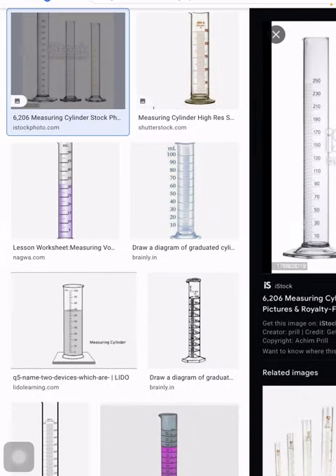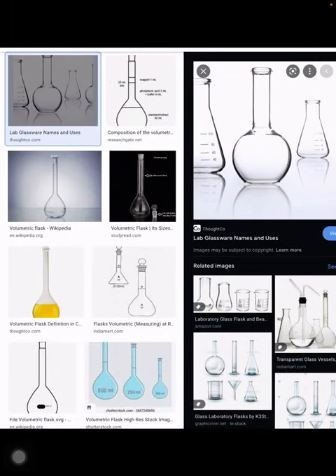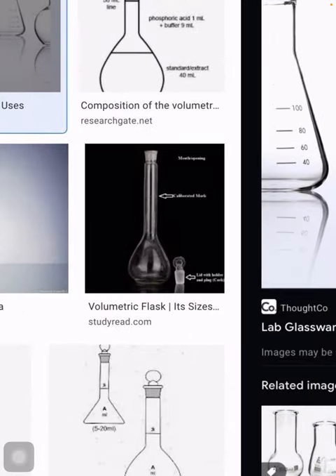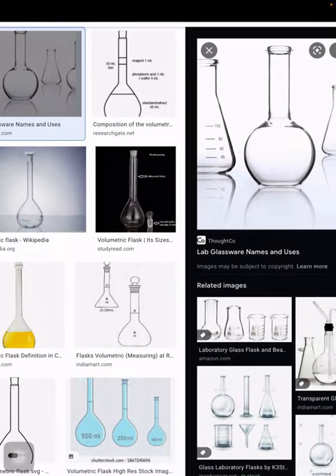Now moving to the next side — this is the volumetric flask or measuring flask. It is a flask with a long narrow neck and has one calibration mark at the top. I'm zooming in and you can see the arrow at the neck — that is the calibrated mark, indicating this flask can measure 25 cm³, 100 cm³, or 1000 cm³. It is available in different sizes.